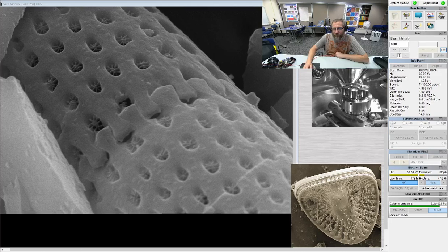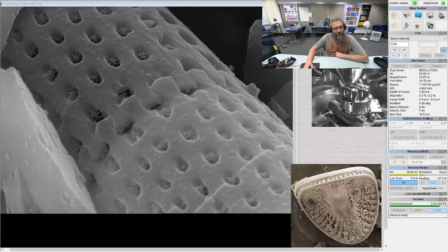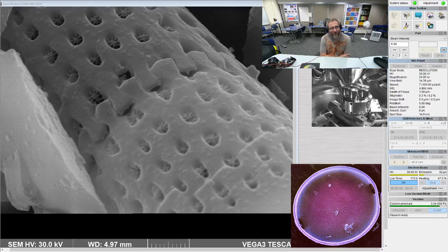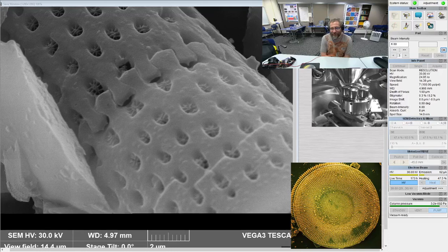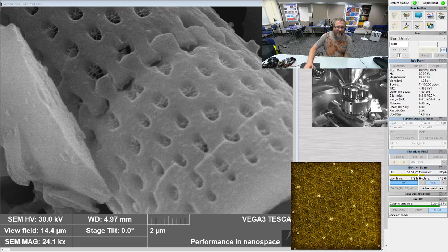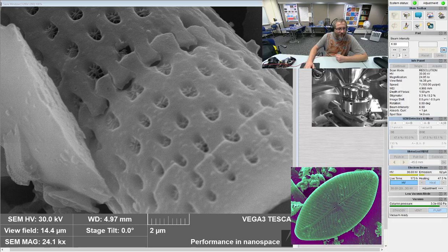Nice. I'm calling it right now. I think this picture is going to end up in the manuscript. Okay. I have a feeling. You like it that much, huh? Well, you can describe both the spines and the cribra and this funny angular, I don't know what you'd call it, gash, or on the bottom right of the screen, there's kind of that ridge that goes across there. It's from where the girdle band. Yeah, where the girdle band has constricted. Yeah, yeah. So those are really interesting. The spines are really interesting to me because they're like, I don't know, keystone shaped maybe?